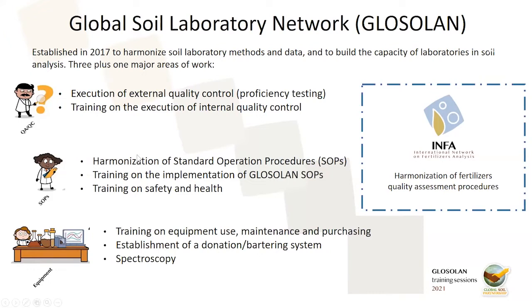implementation of these SOPs. And also these trainings are on other topics like health and safety, equipment, and many other topics. For instance, today's training is about this. So today we will present the SOP, the standard operating procedures for handling and preparation of soil sample. That was an SOP that was harmonized and published by GLOSOLAN 2 years ago. And today this training aims to facilitate the implementation of this SOP in order to allow all labs to perform sample preparation in the same way, because this, of course, is a basic step before the analysis occur.